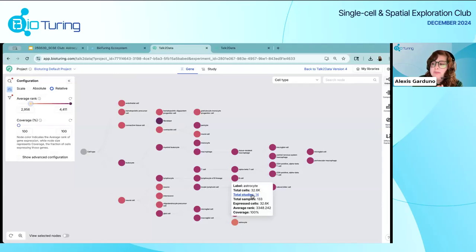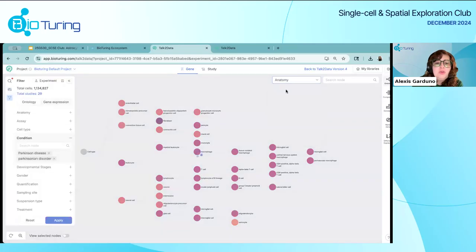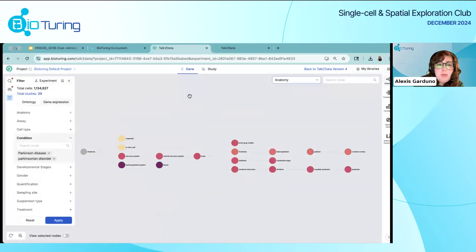And this is showing this absent transcription across different regions. So if we really want to see, okay, how is this consistent in different regions of the brain? Can we actually look at these differences? You are able to do that. So if we want to go into that specific area, we can go into this specific filter here and actually look at the anatomy of different brain regions. So looking at the expression of this particular marker or transcription factor within these samples, we can see that it's specific to very specific brain regions.